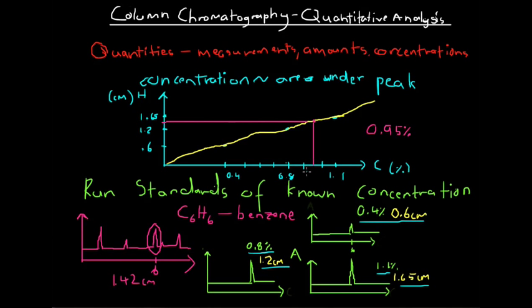So here we can see fairly accurately that we have a concentration of 0.95% for this sample, and so that is the concentration of benzene or C6H6 in my fuel sample. So that is our final answer.